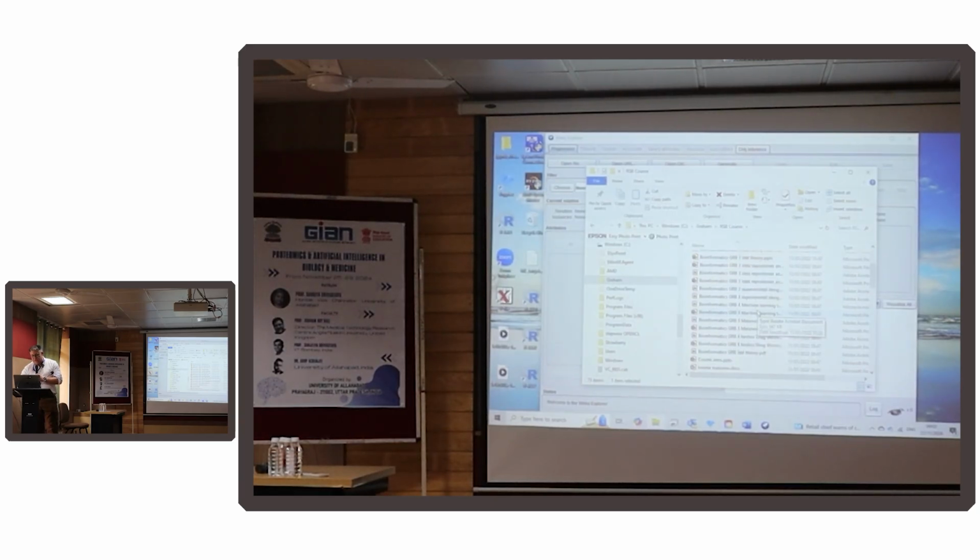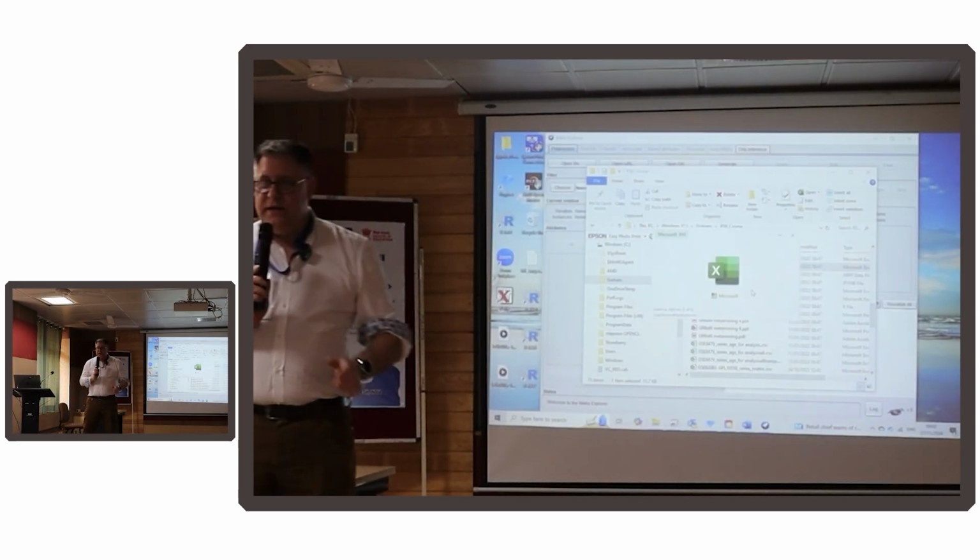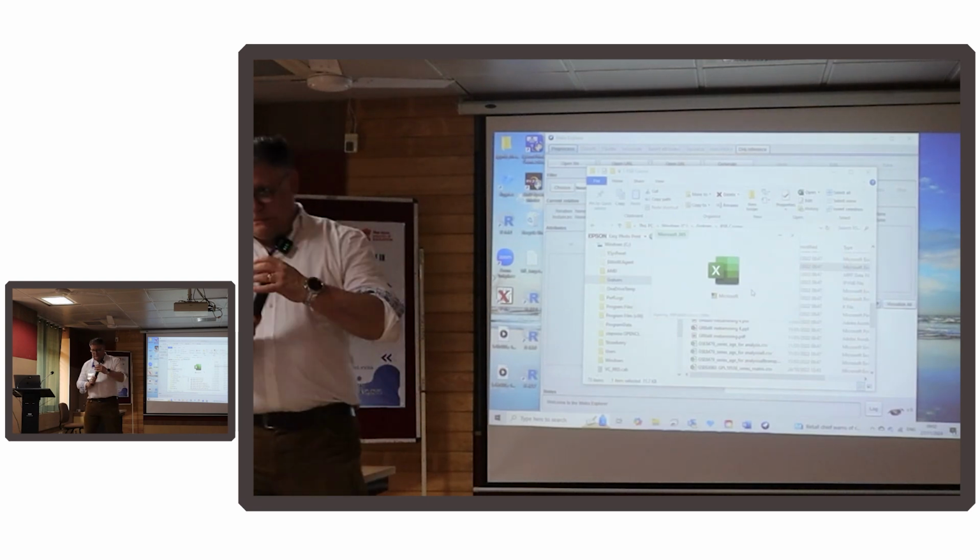I'm just going to show you the format of a file. And just something particular to Weka that you have to do.